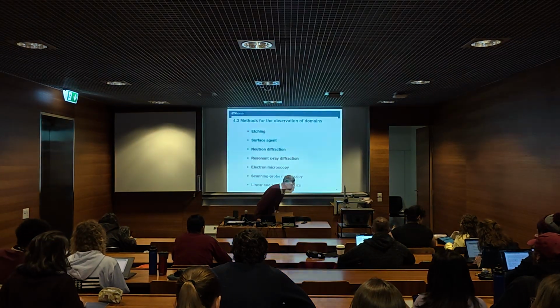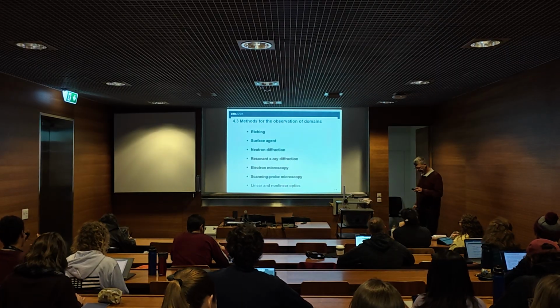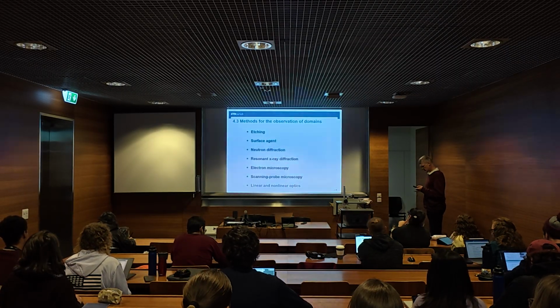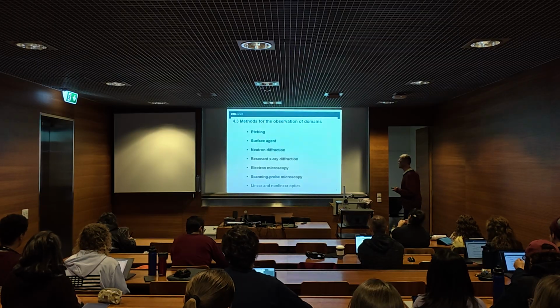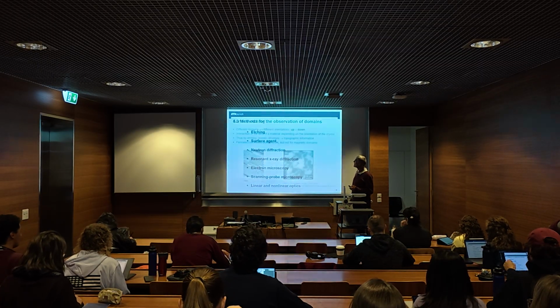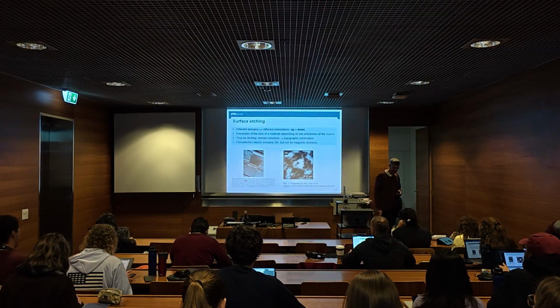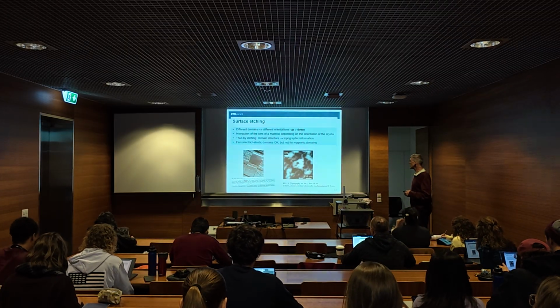Meanwhile, let's look at some methods for imaging domains. As usual, a table of contents, and then we just go through all these examples. So, one method to image domains, a very historic one, is surface etching.